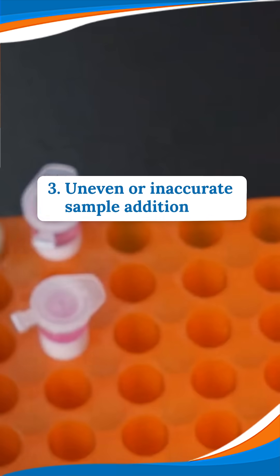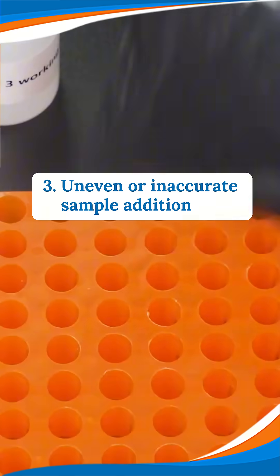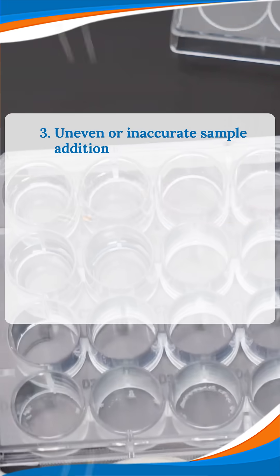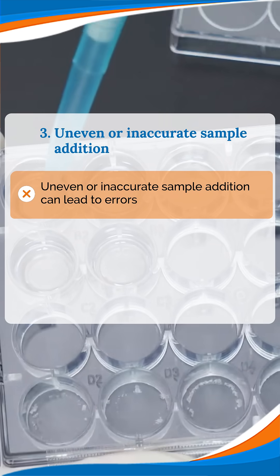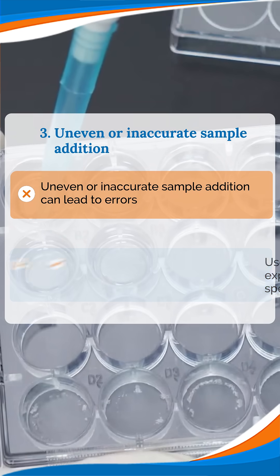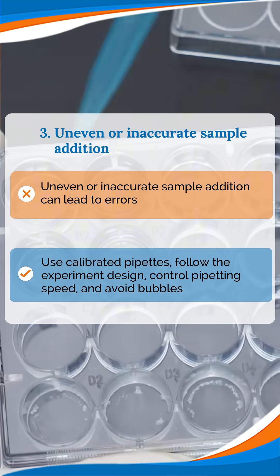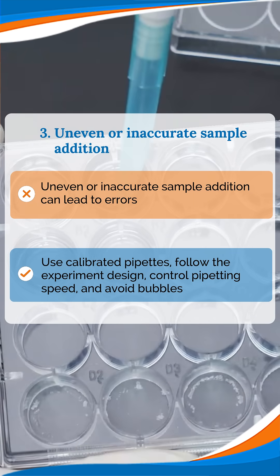Issue 3: Uneven or inaccurate sample addition can cause errors in your results. Tip: Use calibrated pipettes, follow the experiment design closely, control the pipetting speed, and avoid introducing bubbles.